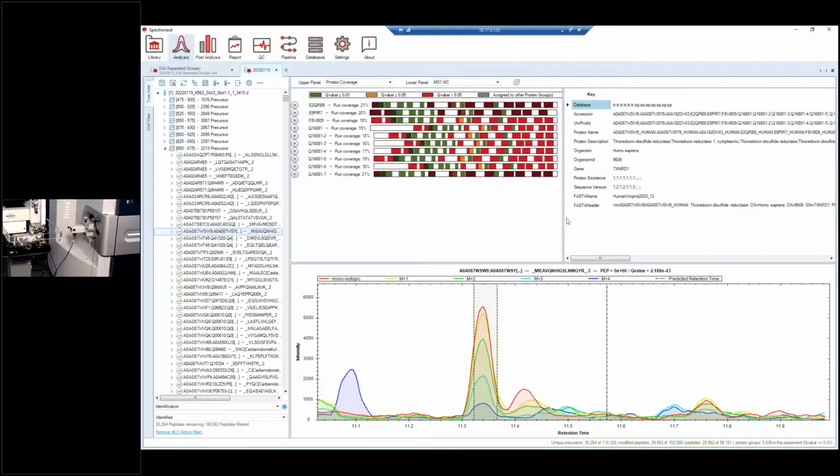So if you wanted to contrast the two software packages, it's really that Spectronaut is a more commercially supported software, but of course has a cost behind it, whereas DIA-NN produces as good or better IDs and quantitative results, but without the user interface that you see here.